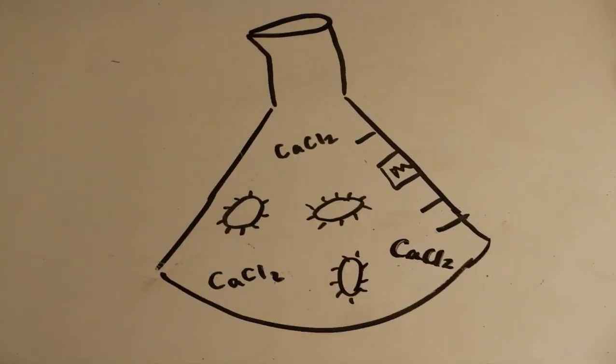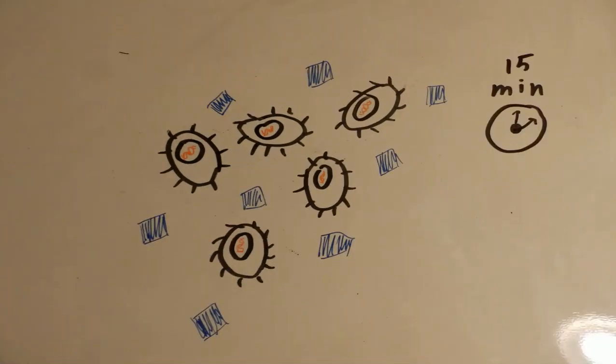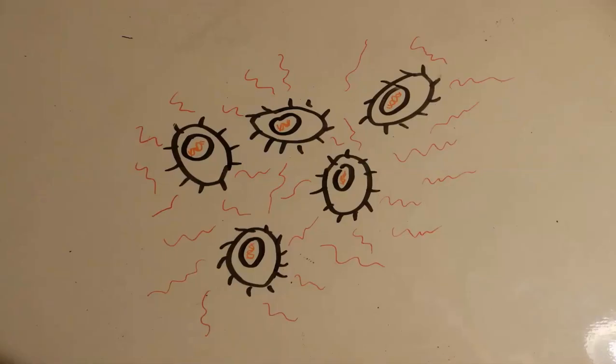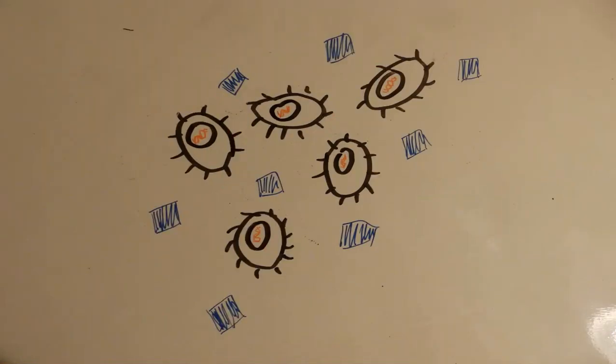The genes are added to the competent E. coli cells, and the cells are then isolated on ice for about 15 minutes. This isolation step allows the plasmid to come into close contact with the cells. The E. coli cells are then subjected to heat shock in order to disrupt the cell's membranes and create pores in the membranes for the uptake of the plasmids. The heat shock lasts for 1 minute. The cells are then placed back on ice in order to retain the plasmids in the cell.